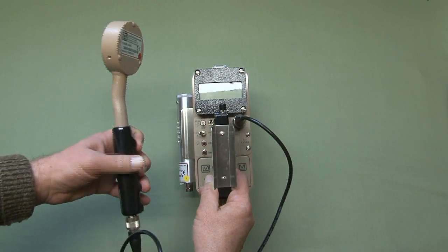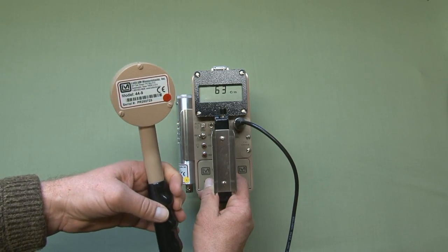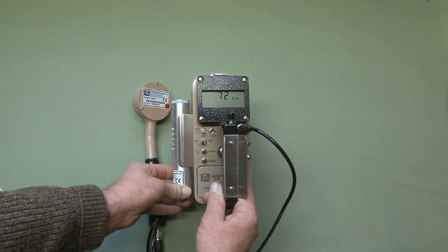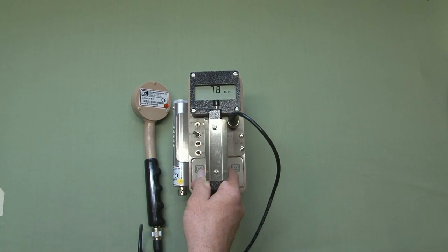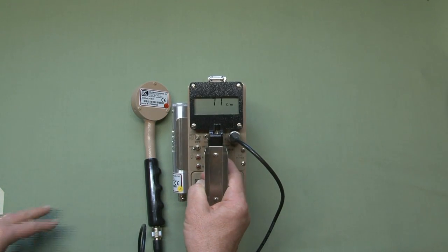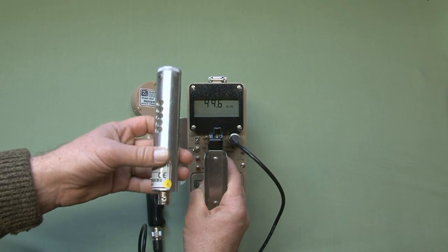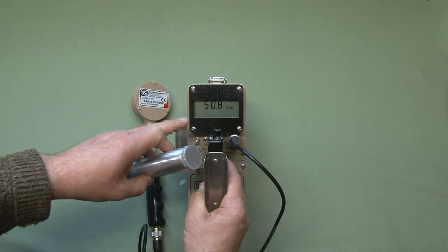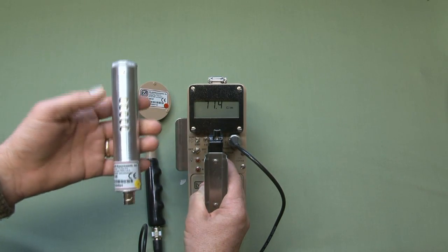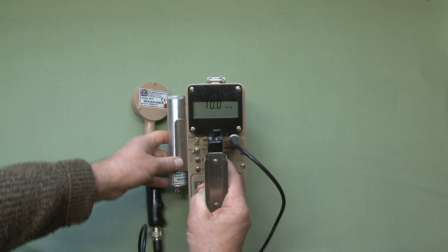The one I'm demonstrating here today has been calibrated with two different probes: the Model 44-9 pancake GM probe, typically used for contamination surveys, and the Model 44-38 probe, typically used for dose rate monitoring. You want to make sure you're familiar with the capabilities and limitations of the detectors you're using. For example, this instrument is capable of displaying dose rates up to 9,999 R per hour or Sieverts per hour, but the detection range of the detector limits you. The Ludlum Model 44-38 is limited to up to about 500 mR per hour on this type of digital instrument that has dead time correction.